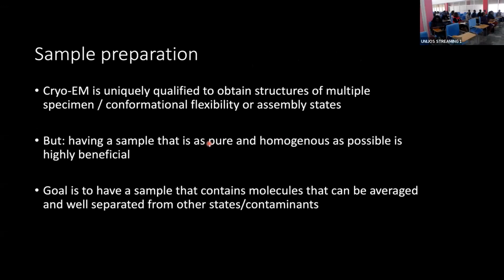Sample preparation is critical. However, if you look at the literature, you will find that some people say that it's less critical than for other structural techniques, because cryo EM is uniquely qualified to obtain structures of multiple specimens or conformationally flexible specimens or assembly states.